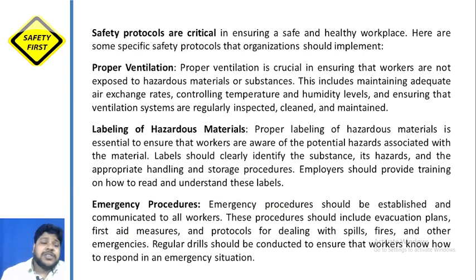सेफ्टी प्रोटोकॉल्स की ज़रूरत क्या है. क्यों हमको ये सब कुछ लिखा होना चाहिए. जहाँ पे कुछ होता है वहाँ पे ये सब प्रॉपर लेबलिंग होनी चाहिए. प्रॉपर तरीके से लिखा जाता है. ये सब की ज़रूरत क्यों है. क्योंकि अगर हम एक सेफ और हेल्दी वर्क प्लेस चाहते हैं तो सेफ्टी प्रोटोकॉल्स बहुत इंपॉर्टेंट हैं.